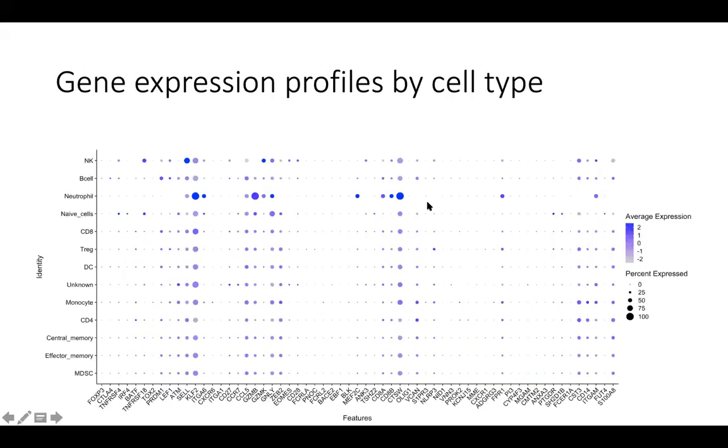So that's sort of the gist of the single cell gene expression data analysis that we perform. There are a few other things that we can typically look at, but that's more customized. But this would be the standard advanced analysis pipeline that we typically run. Any questions until this part?